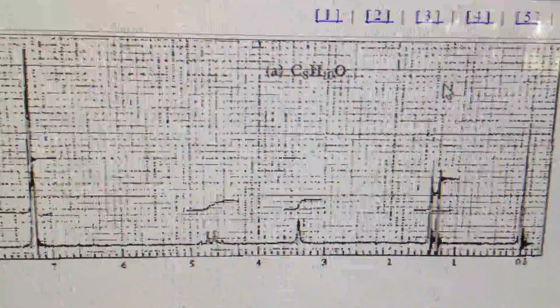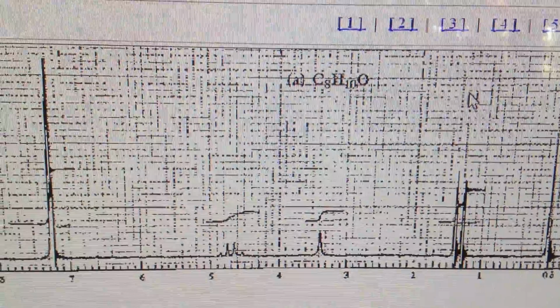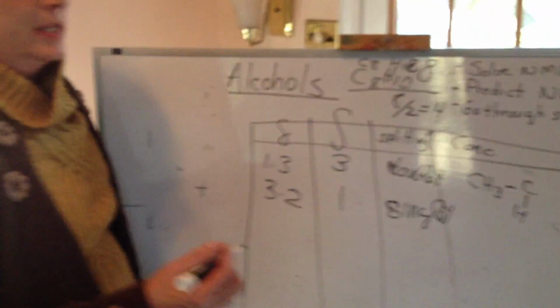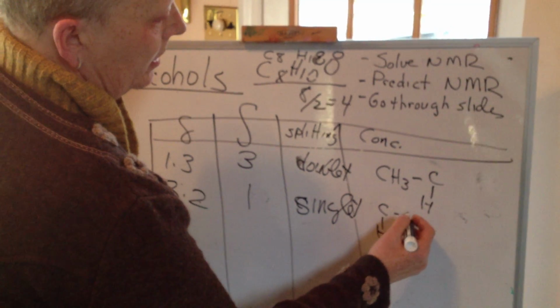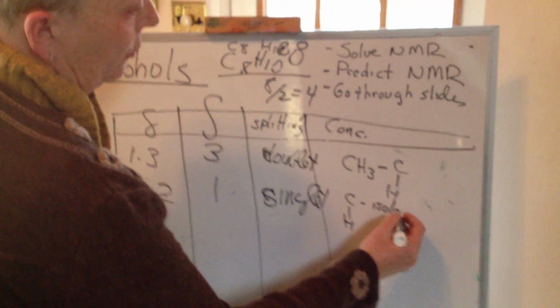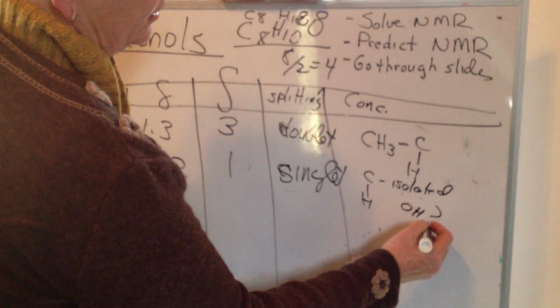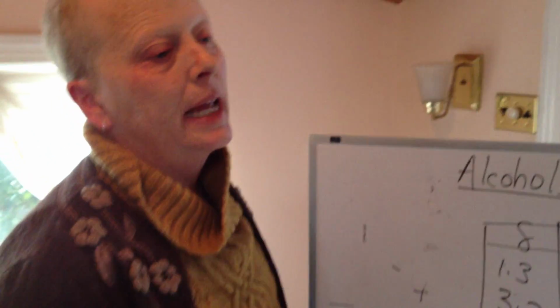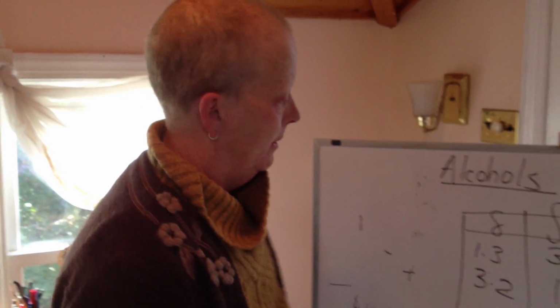So in a typical NMR spectrum, an alcohol will be a broader singlet. But at this juncture, you wouldn't really know what this is. You'd say, well, maybe it's a CH with no neighbors. You know, is it isolated? That it could be that. Or is it an OH? This should enter into your mind. How do they show up in the spectrum? But I'm just saying in terms of its sort of topography there, that looks like an OH to me.